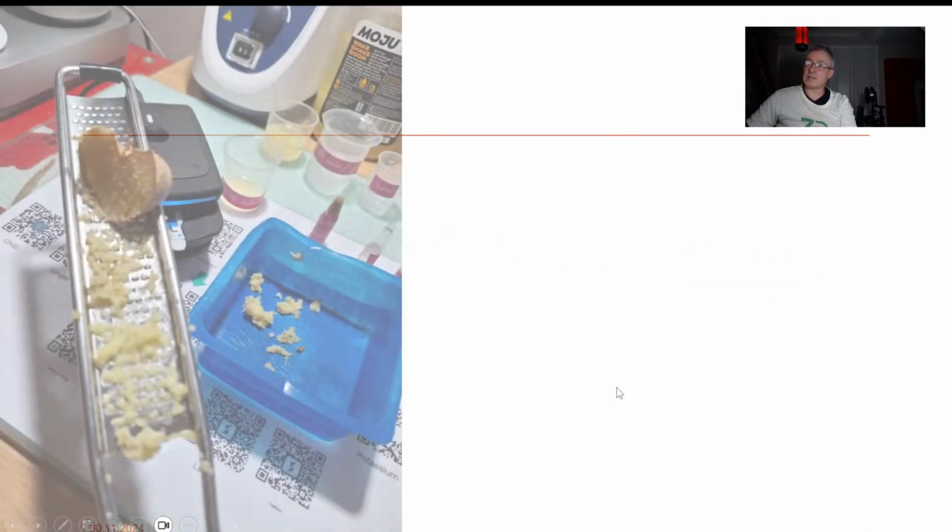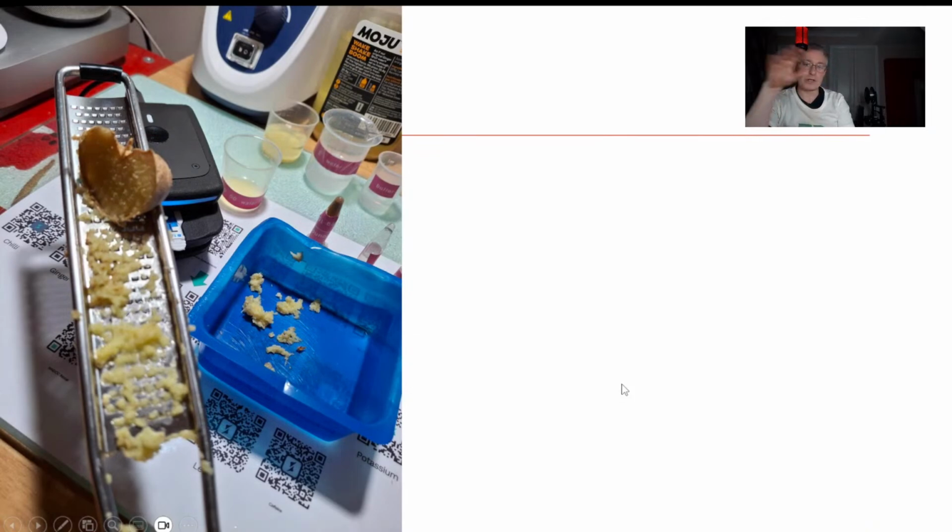So this is something that I did earlier on. Now I know this paper is about milk, but I just want to talk about how samples don't have to be clean and elegant in order for electrochemistry to work. So this is literally something I did earlier on. This is, in fact, here it is.